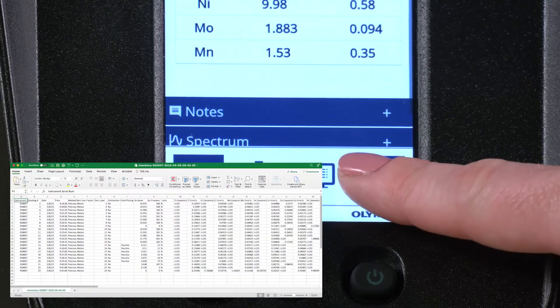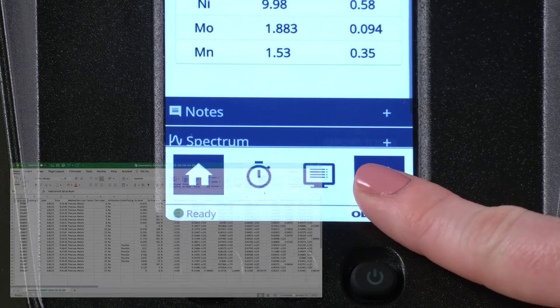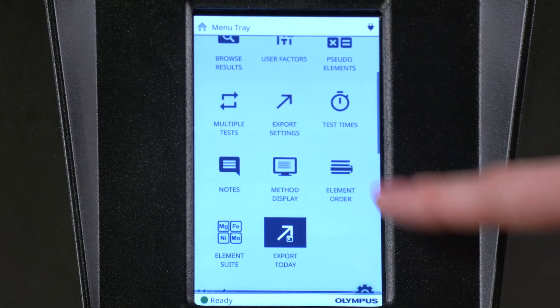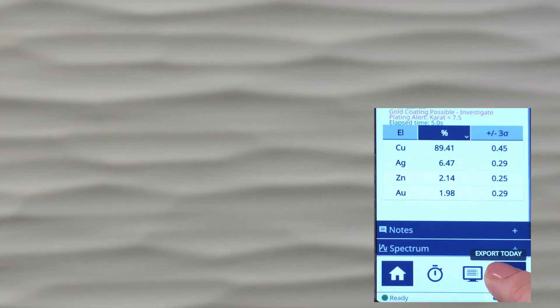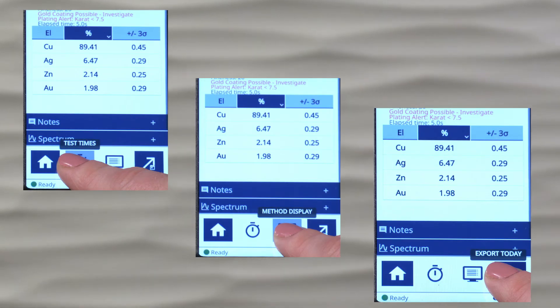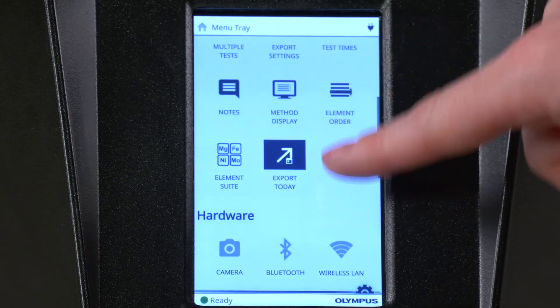To export the results as a spreadsheet, press the Export Today button in the Favorites area. You can configure the export and access other options in the main menu tab. Shortcuts to common actions are at the bottom of the screen. You can find the full menu by pulling down the gear icon at the top right of the screen.